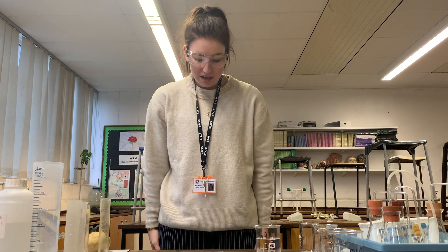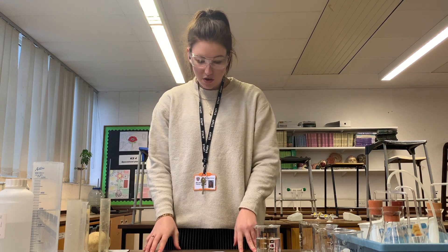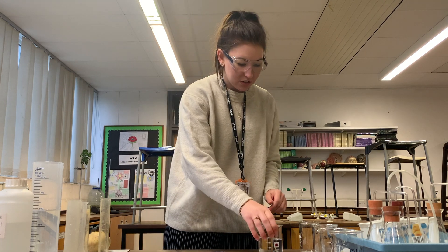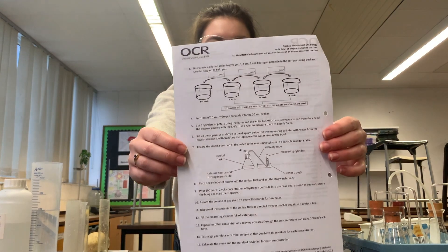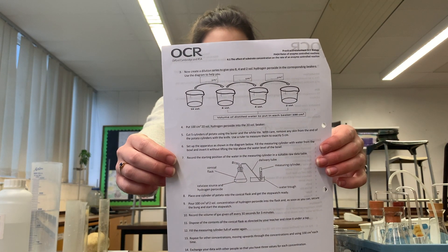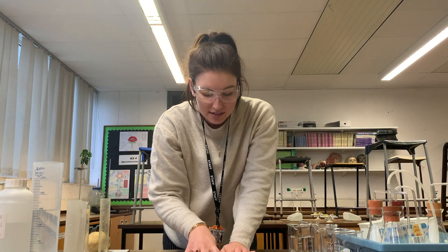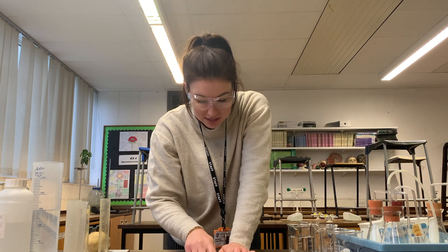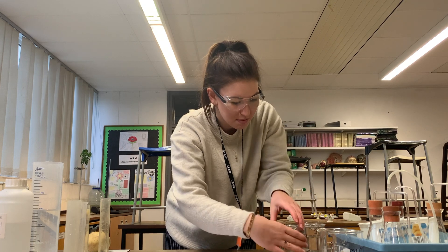Next we have to create a dilution series to give us 8, 4, and 2 vol hydrogen peroxide in the corresponding beakers. The diagram says at the bottom that our 8 vol, 4 vol, and 2 vol beakers each need to have 100 centimetres cubed of distilled water in them.